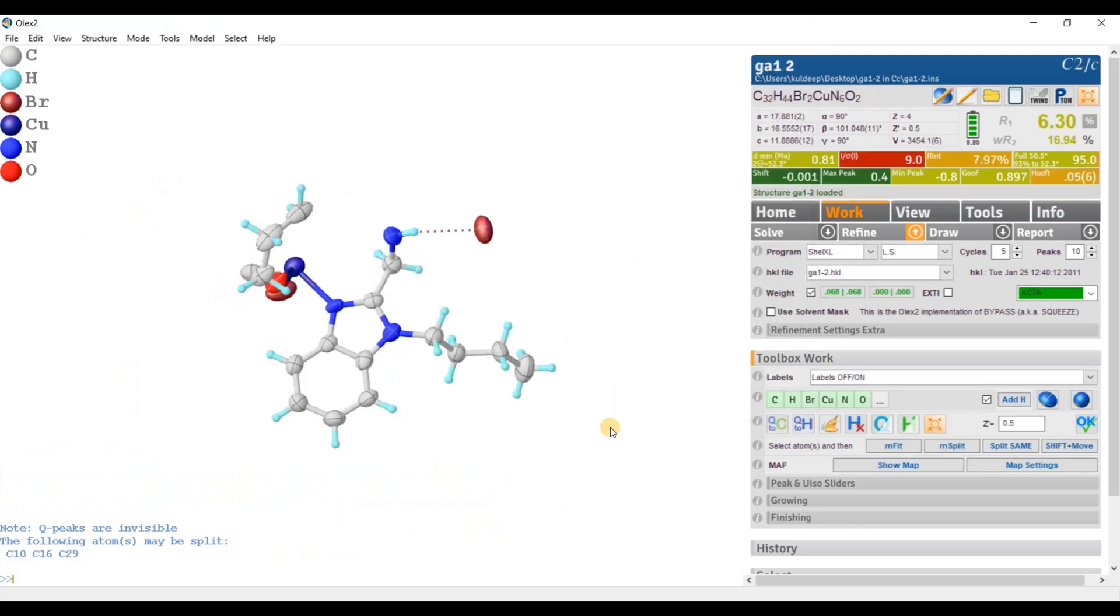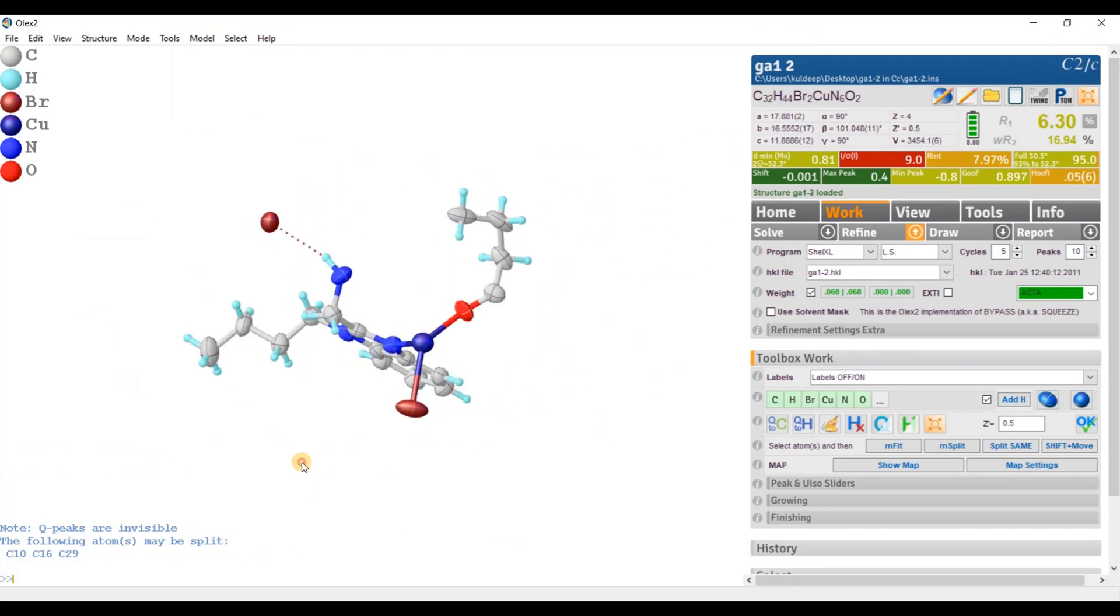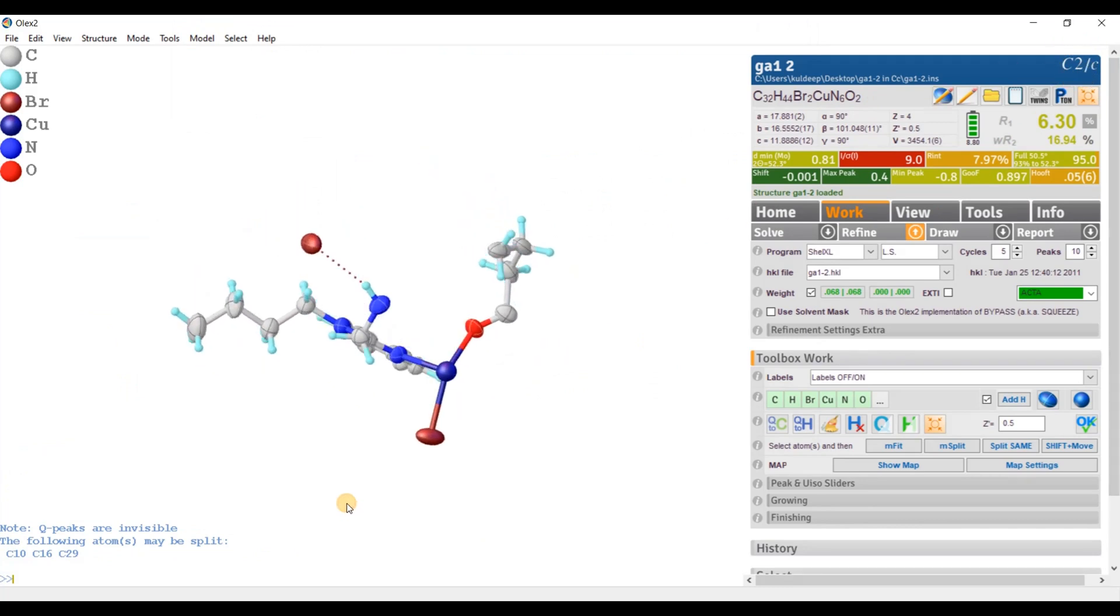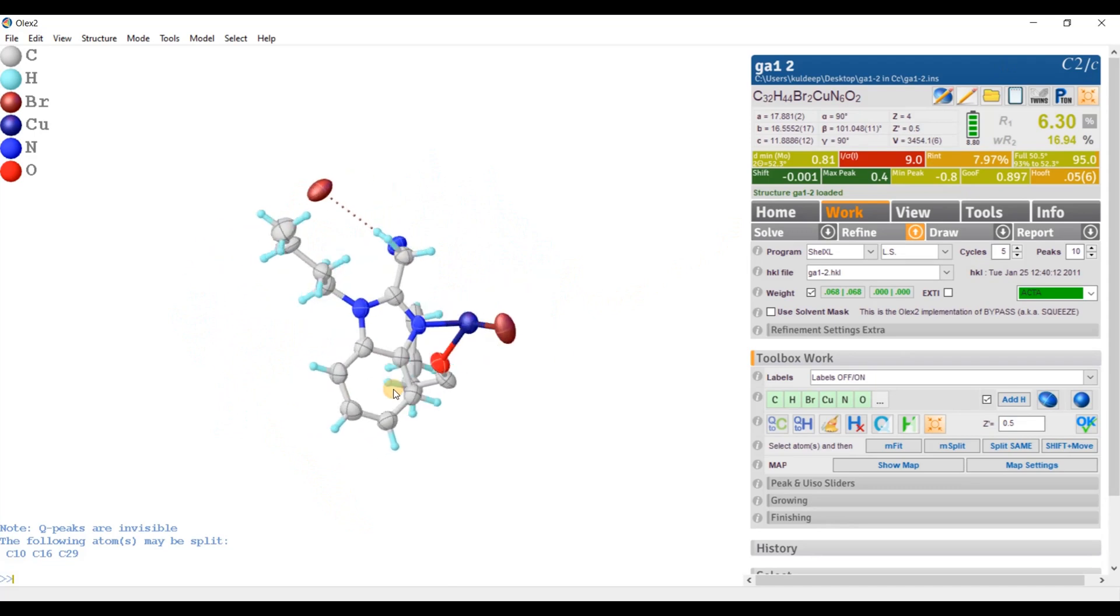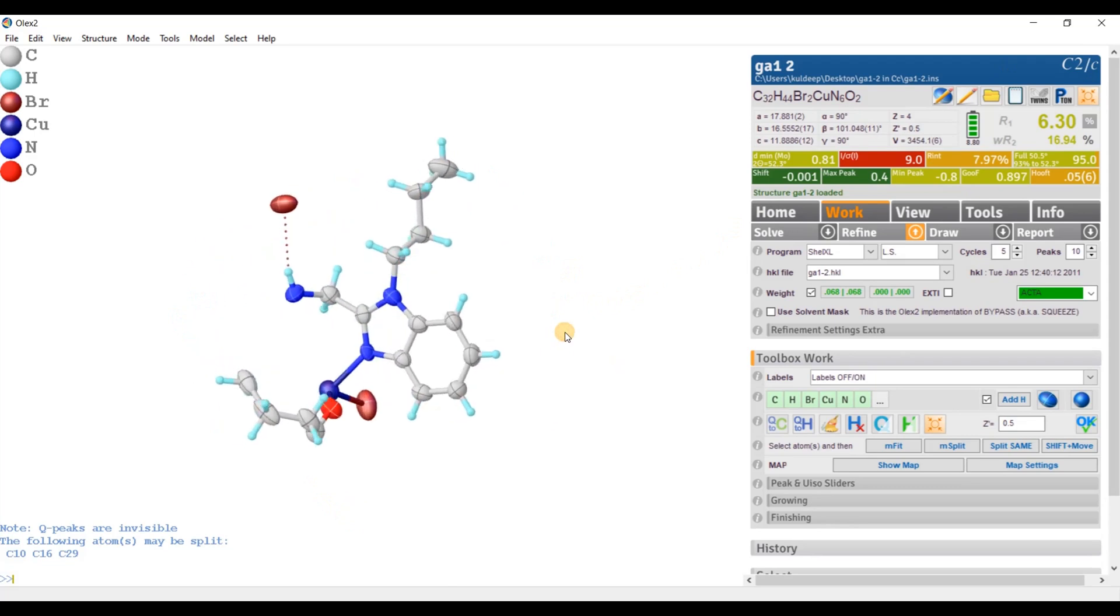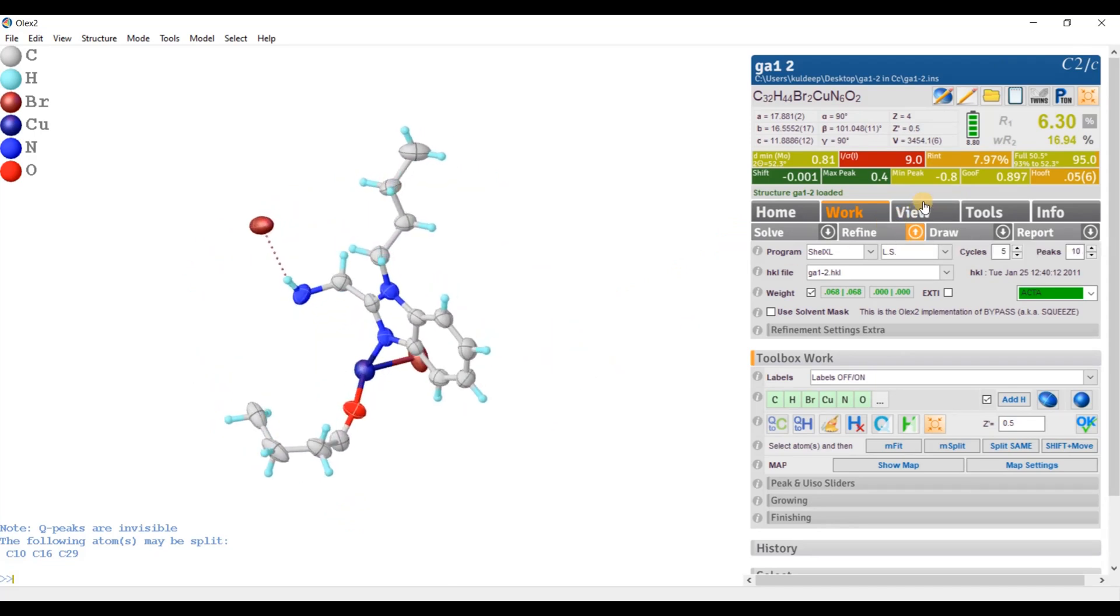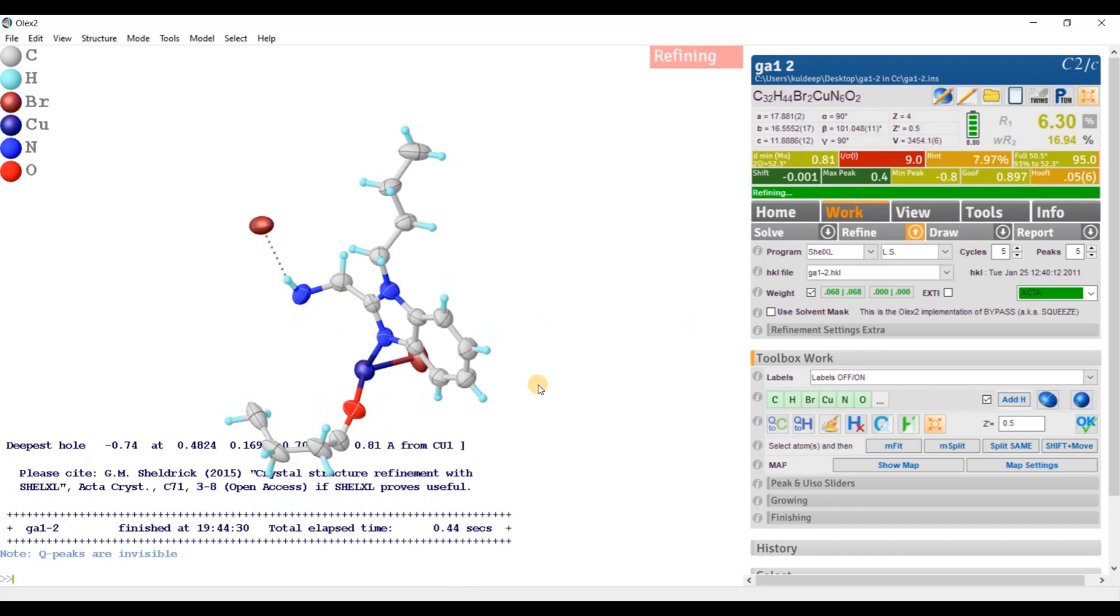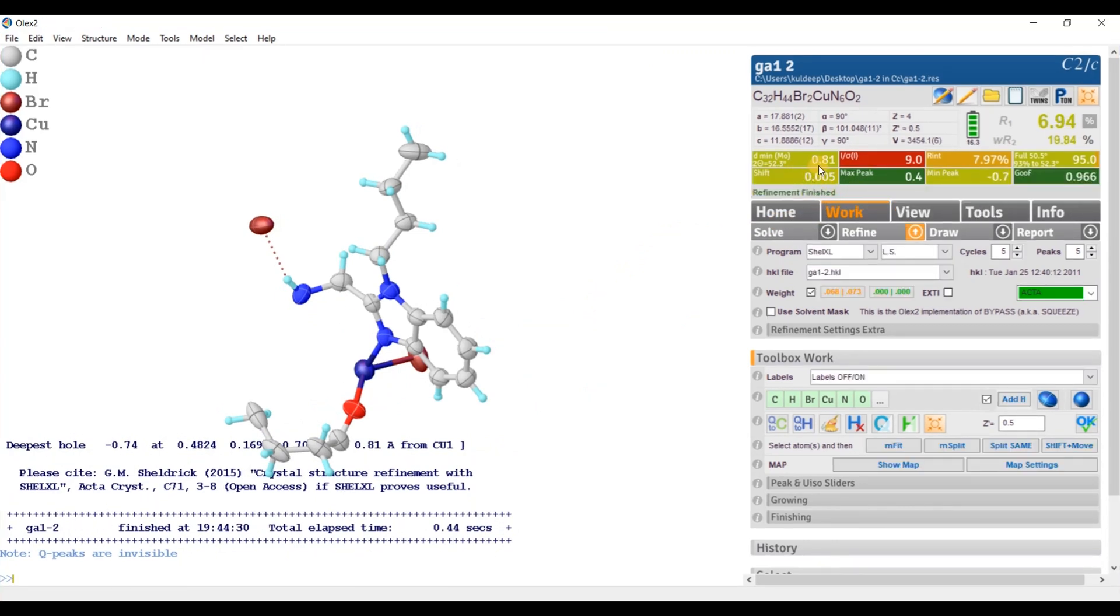So now you can see the space group is changed to C2/c and there is no more alert regarding this check. Now you can see the asymmetric unit is only half and I am going to refine.